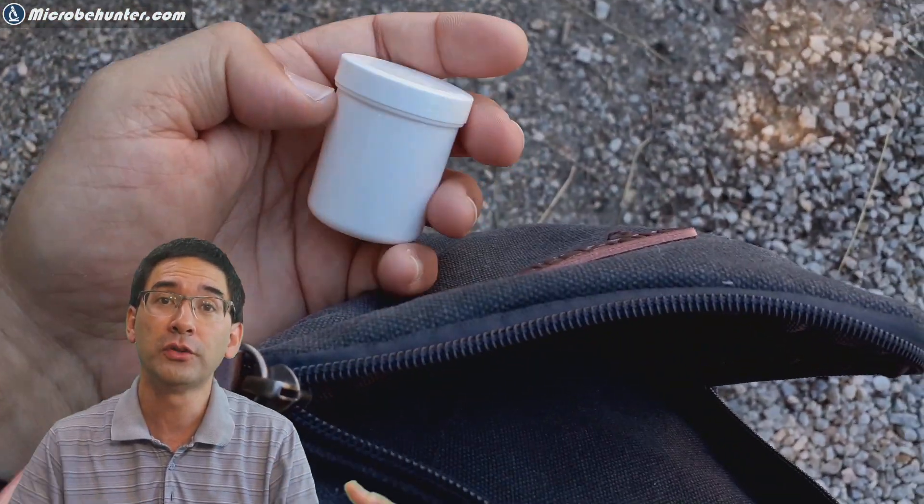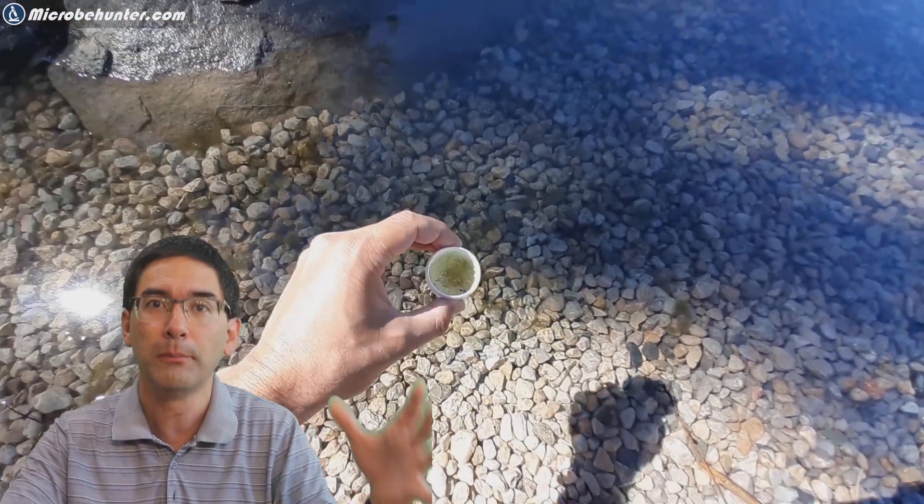Now I already knew that it's going to be probably difficult to find other water microorganisms like ciliates because as soon as the algae are floating around in water and as soon as people are moving into the pond it's quite likely that because of the moving water they're washed out of the algae and then lost in the larger body of water.